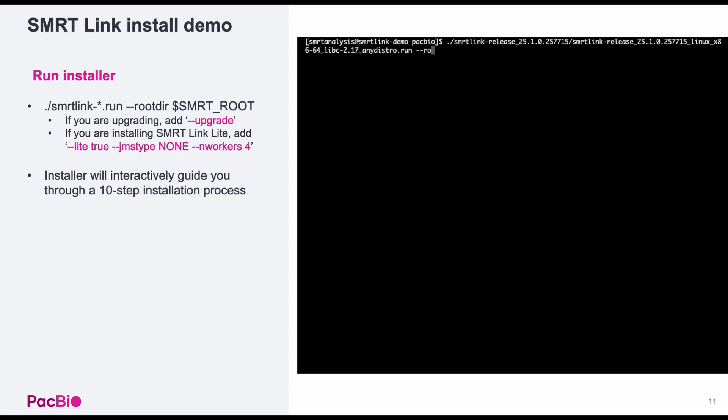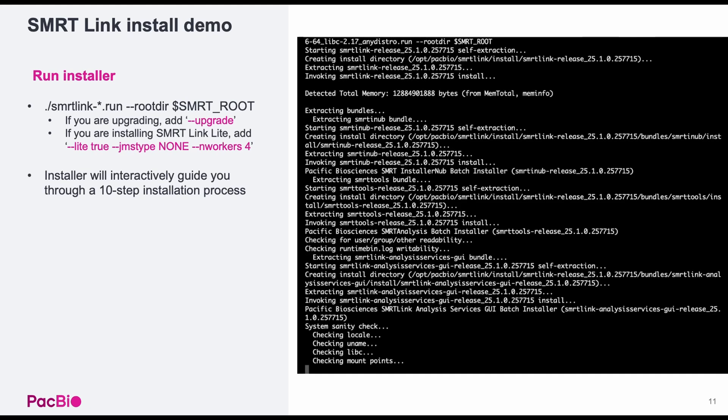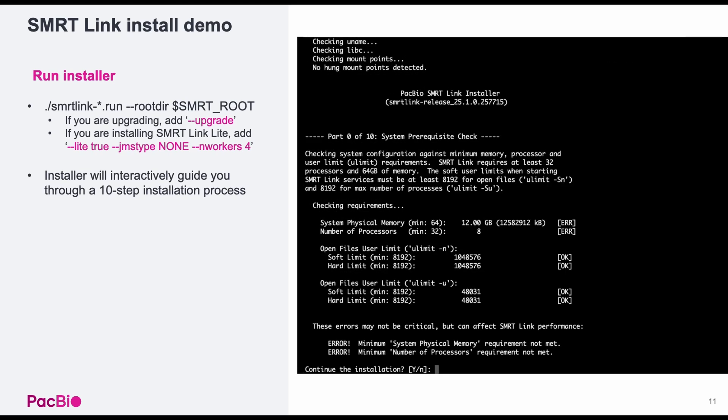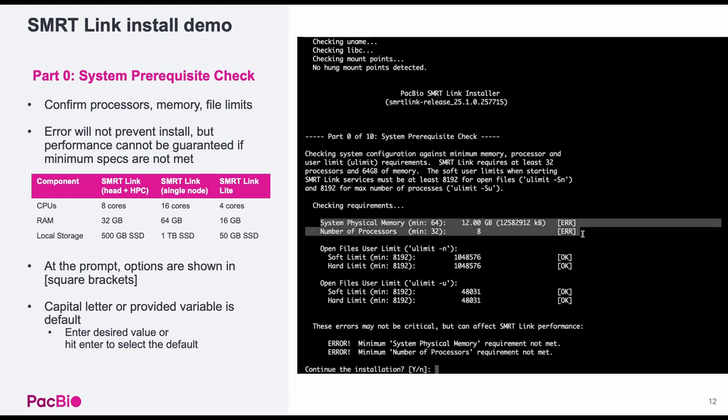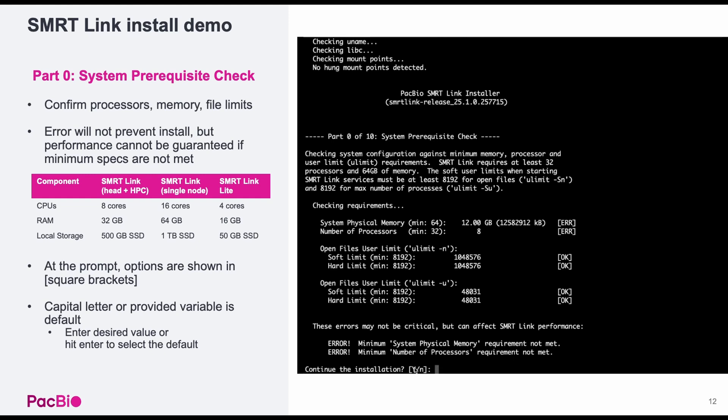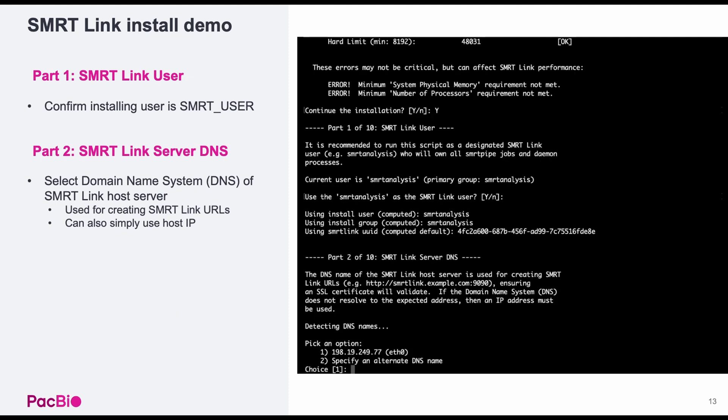When you launch the installer, it will first extract the necessary bundles. After this, there will be 10 steps to go through interactively. Part zero is the system prerequisite check to confirm memory, processors, and file limits. You'll note that I have an error for my memory and processor requirements. While this will not prevent me from installing SmartLink, you should note that the performance cannot be guaranteed if the minimum specs are not met. At the prompt, the options are shown in square brackets. The capital letter is the default choice. You can choose to accept the defaults by pressing enter or type in the letter of the option you want to select. Part one is simply verifying the SmartLink user and can quickly be accepted.